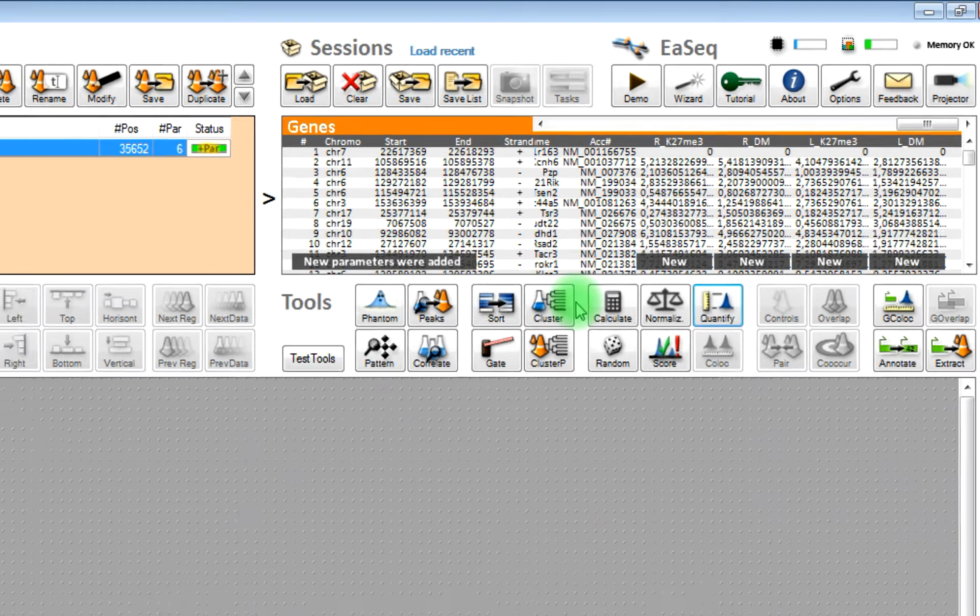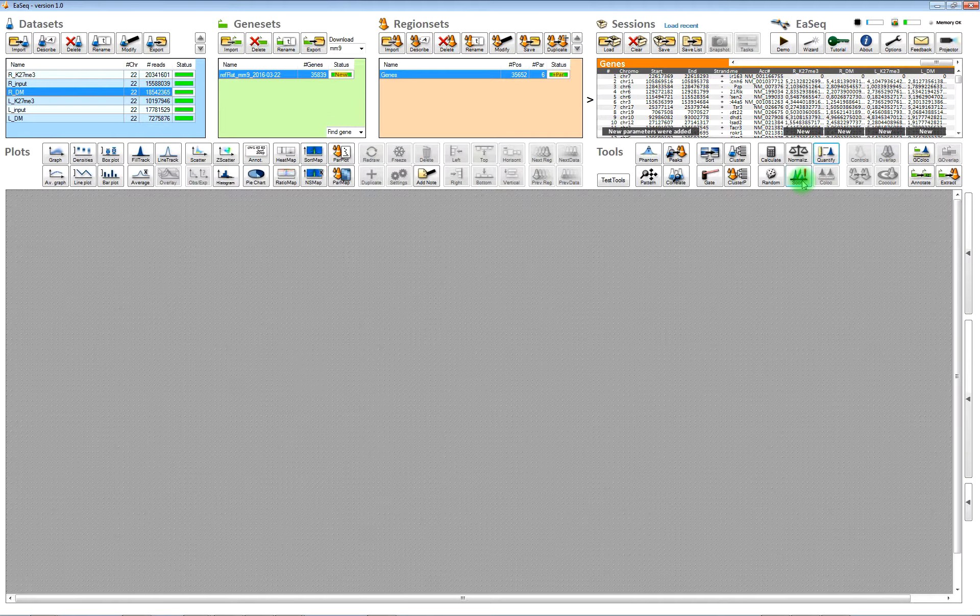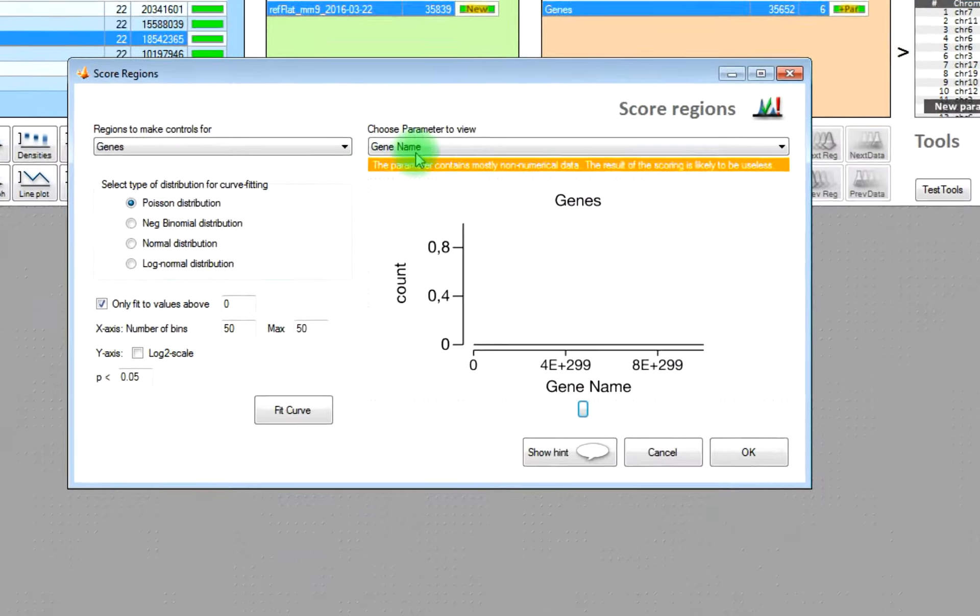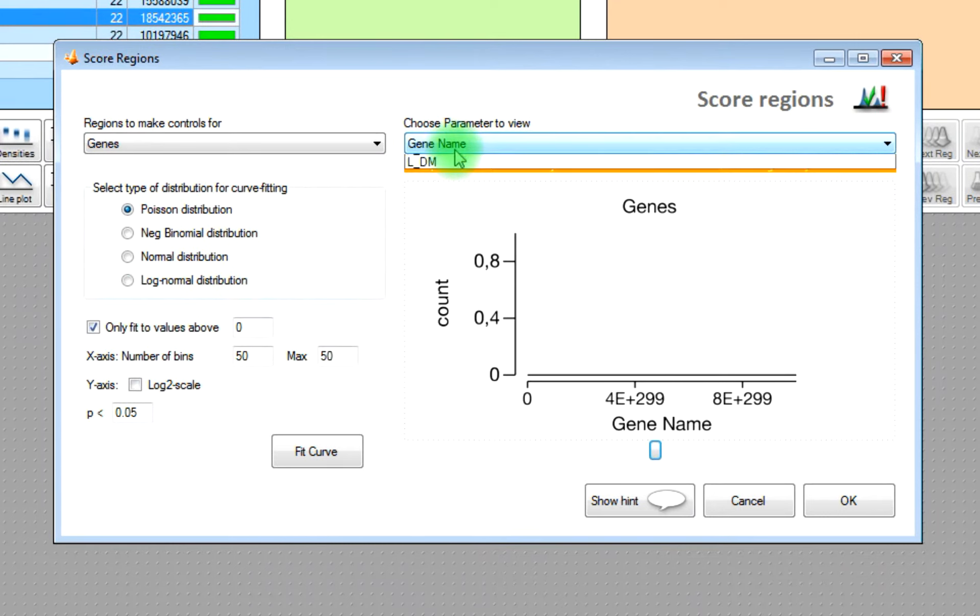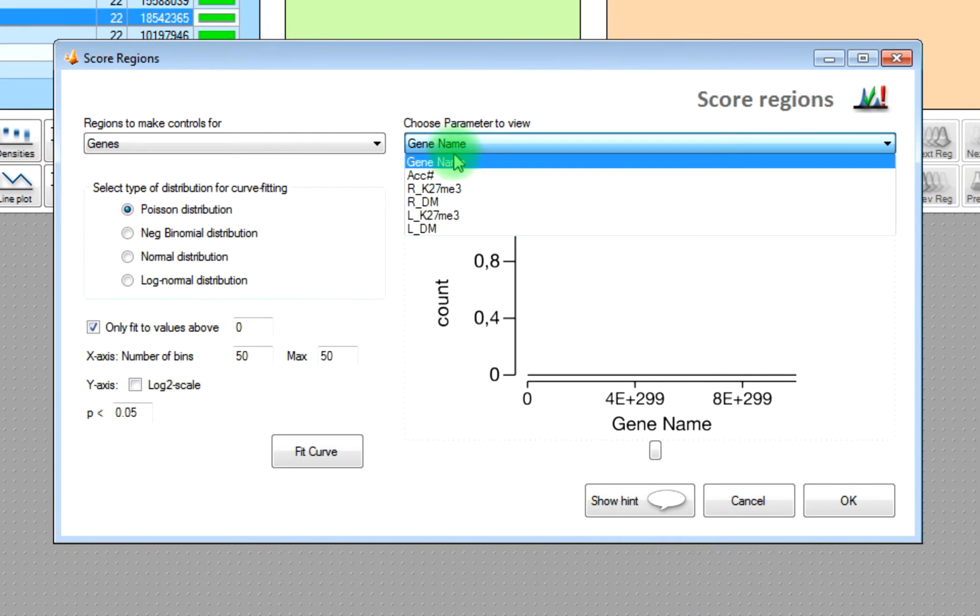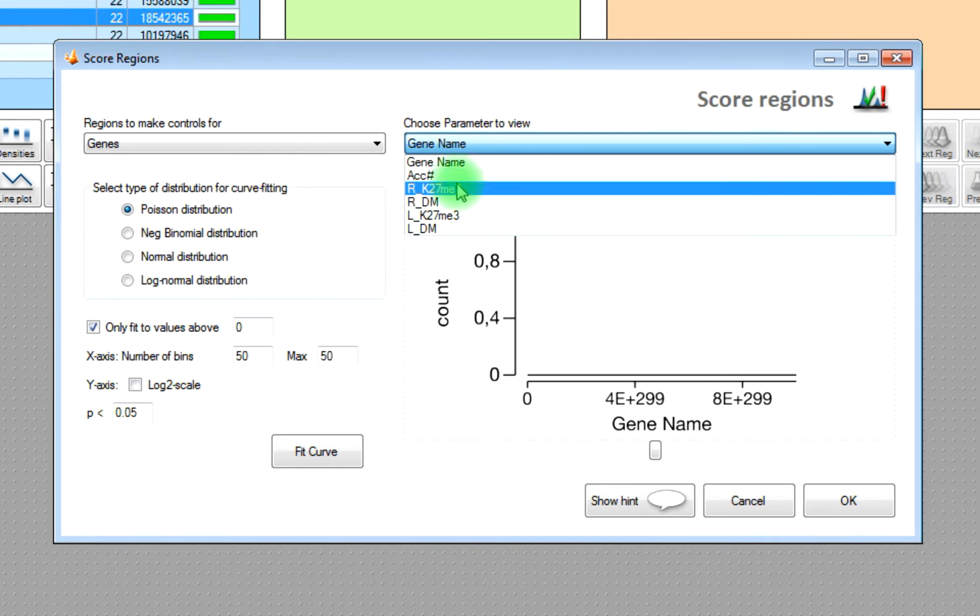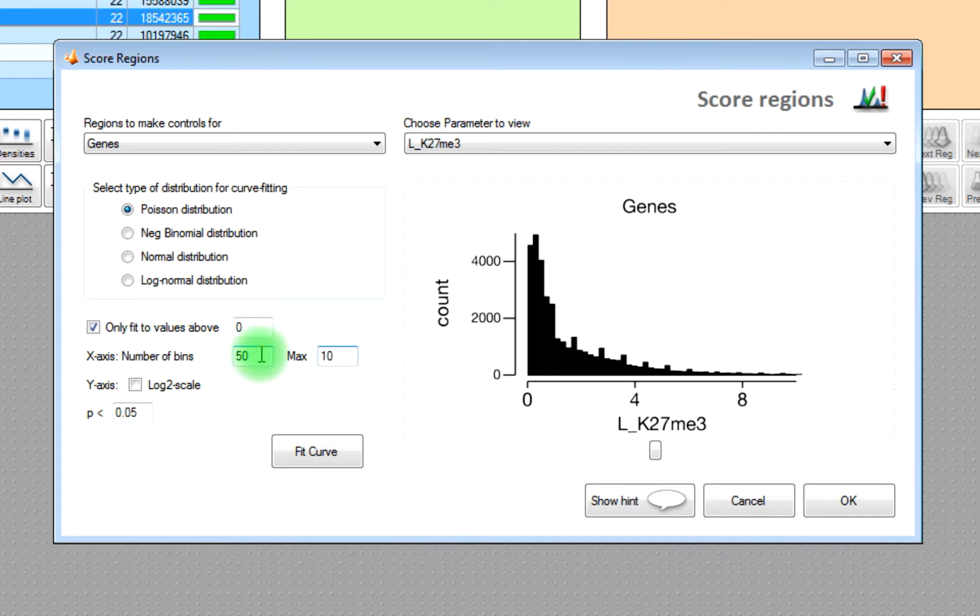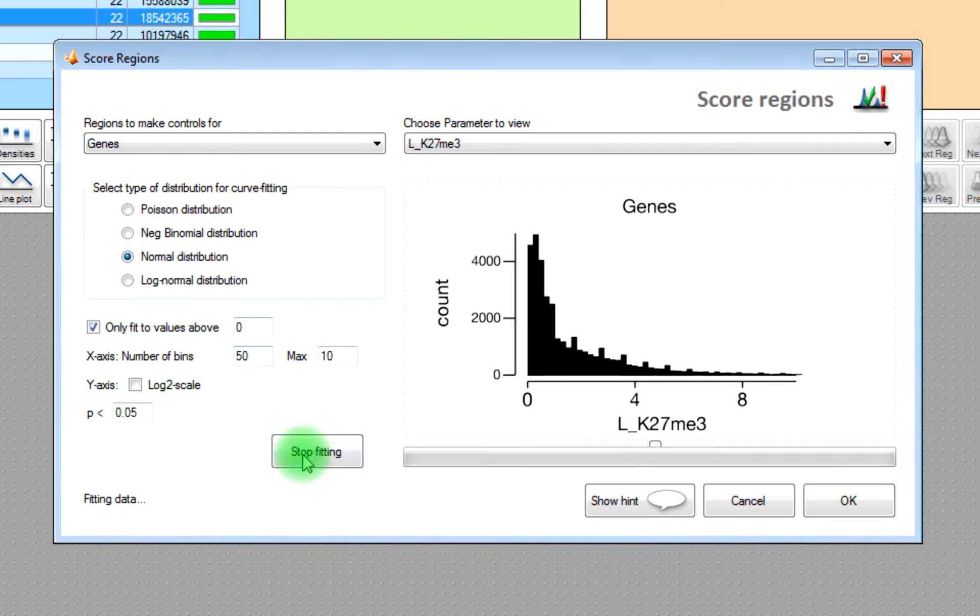And once you have those, then you can start to find the regions with the highest level of one of the marks. You will find the genes with the highest level of K27 trimethylation.